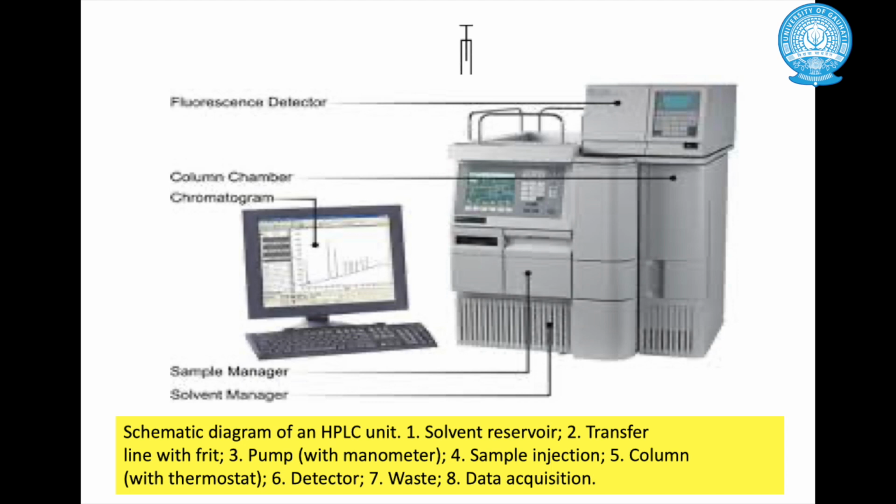which is containing most of the polar compounds present in the sample, because water is polar, so it will be extracting only polar compounds from the sample.